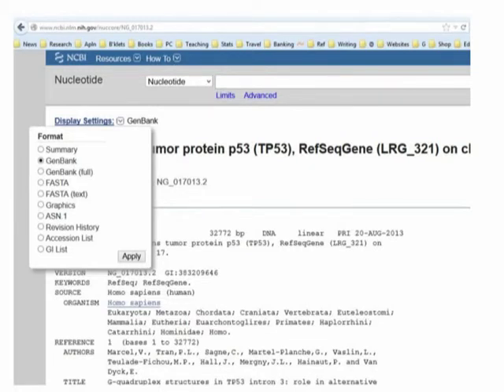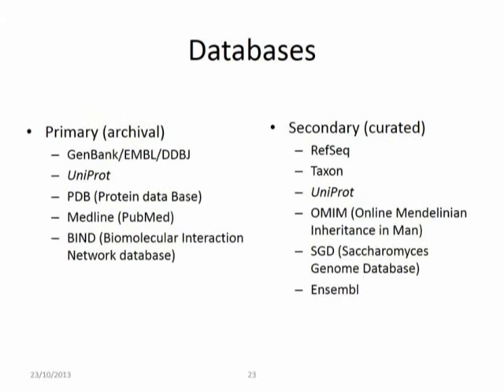You don't really have to memorize all these names - you simply search entries and click on the relevant link. If you want to see the protein sequence or amino acid sequence of P53, you click on the protein database entry. If you want the DNA entry, you go to the RefSeq database entry. On the left or top side you can change display settings to different formats: GenBank full format, FASTA format which is very simple, revision history showing changes as more evidence accumulates, and ASN.1 which looks complex but is more or less like HTML - abstract syntax notation 1.